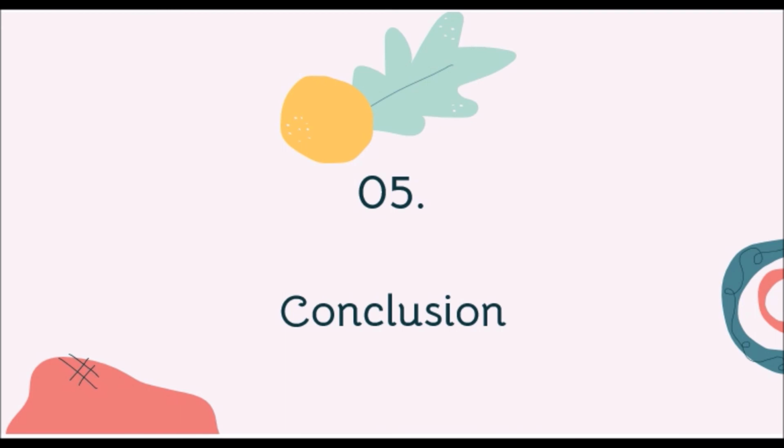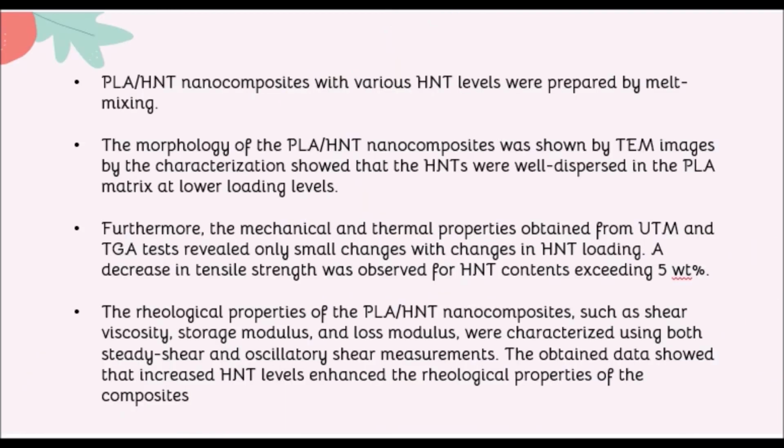And the fifth one is the conclusion. It can be concluded that PLA/HNT nanocomposites with various HNT levels were prepared by using melt mixing. The morphology of the PLA/HNT nanocomposite was shown by using the TEM image, which shows the HNT were well dispersed in the PLA matrix at the lower loading levels. Furthermore, the mechanical and thermal properties obtained from the UTM, the universal testing machine, and the TGA test reveal only small changes with change in HNT loading.